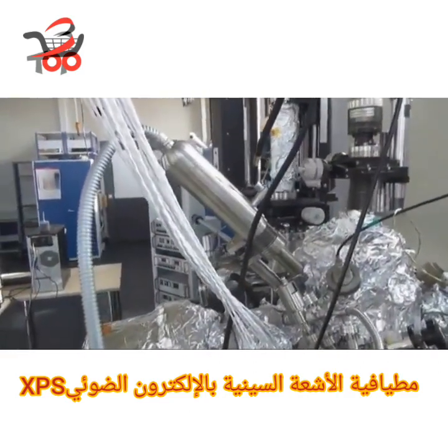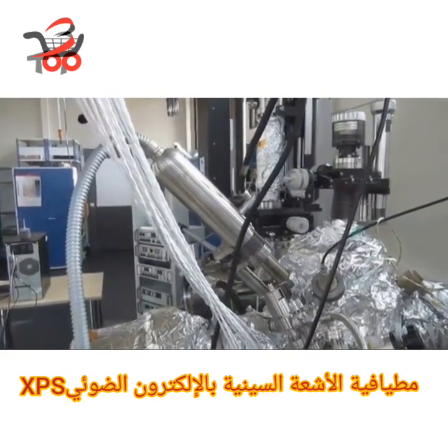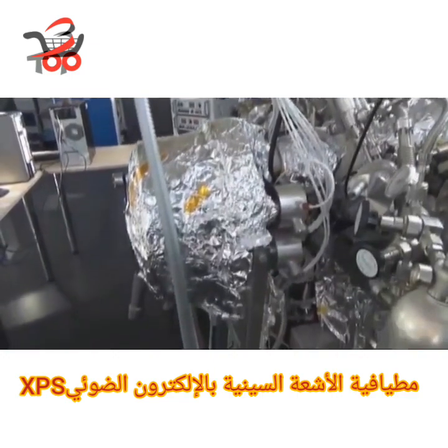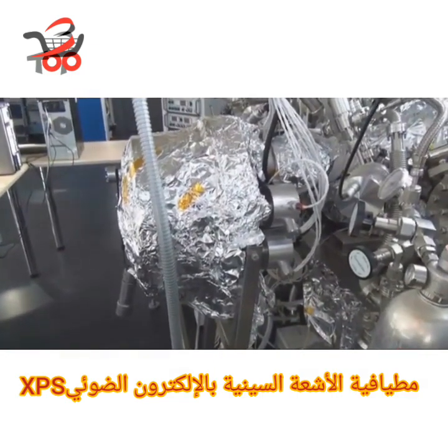Here is the X-ray tube where the exciting radiation is generated. And here is the hemispheric electron energy analyzer.